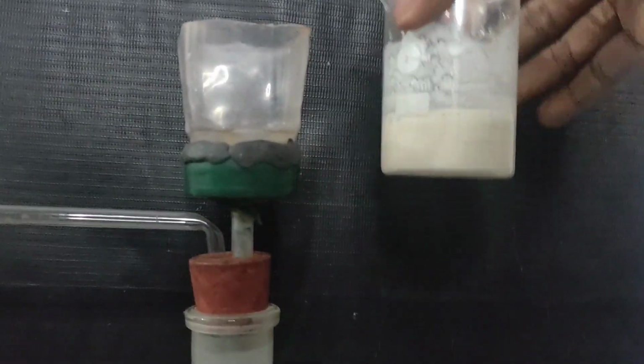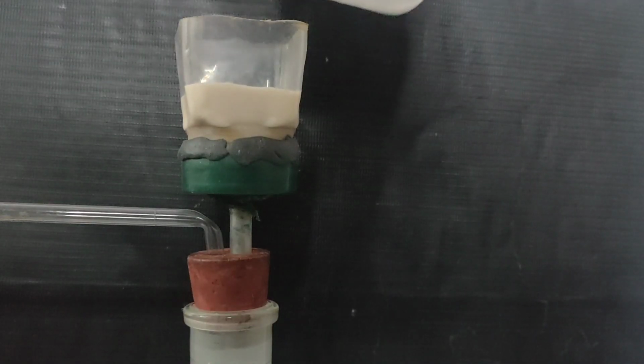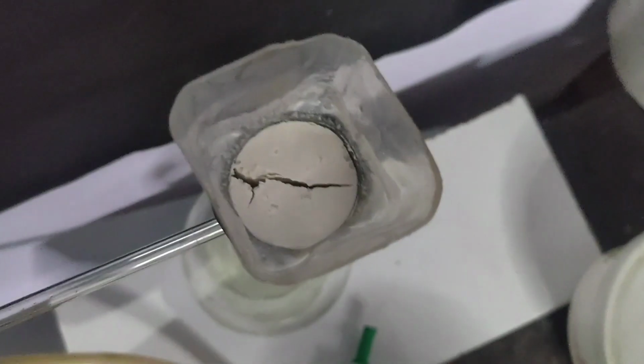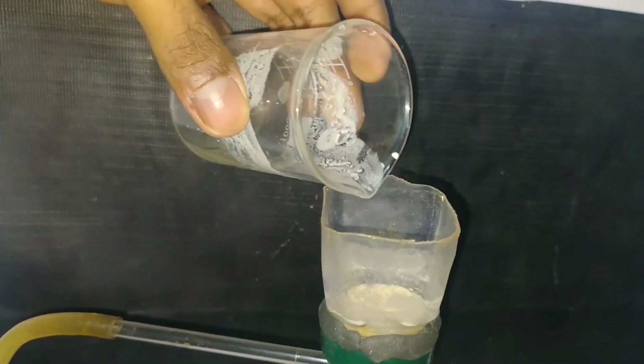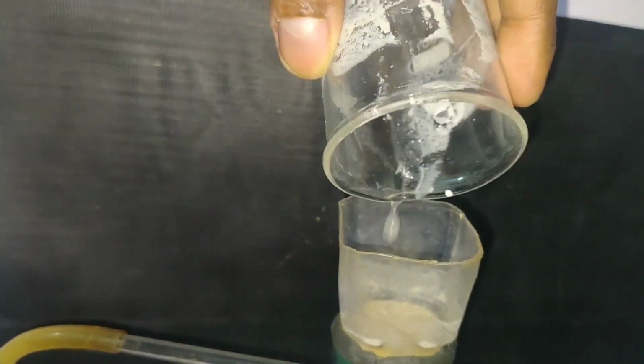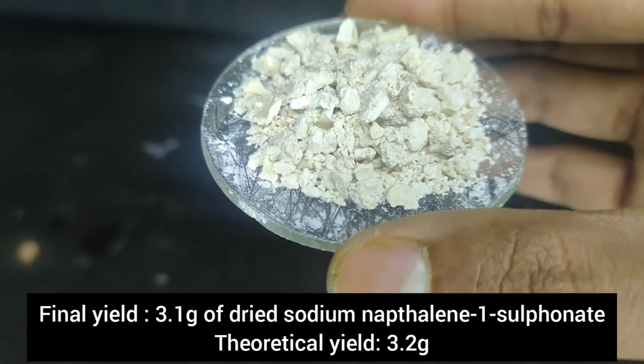The precipitate was then vacuum filtered using a Hirsch funnel. You could also use gravity filtration, but vacuum filtration is better as it is faster. Then I washed the precipitate with some amount of distilled water. This is dried: 3.1 grams of sodium salt of naphthalene 1-sulphonic acid.